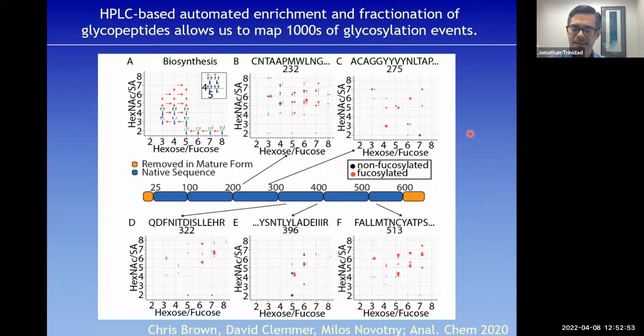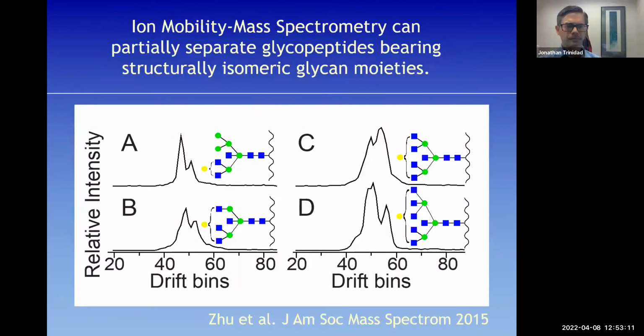And this, I don't have time to get into, but this raises a lot of interesting questions about mapping metabolic rates and thinking about the data, again, more in a relational way about how this protein is actually being processed as it goes through the ER and the Golgi.